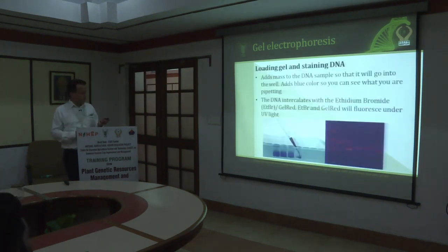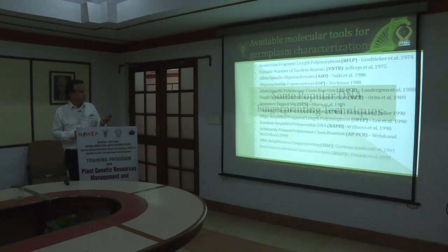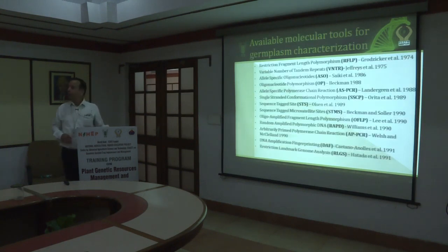So, this is just another continuation of the gel electrophoresis. Coming to some of the basic techniques where these molecular biology techniques are being used. Some popular DNA fingerprinting techniques. If you dive into the literature, you will find a large number of techniques which are modifications of some of the basic techniques. For example, this is a very, very long list, and I have probably compiled it up to 2010.